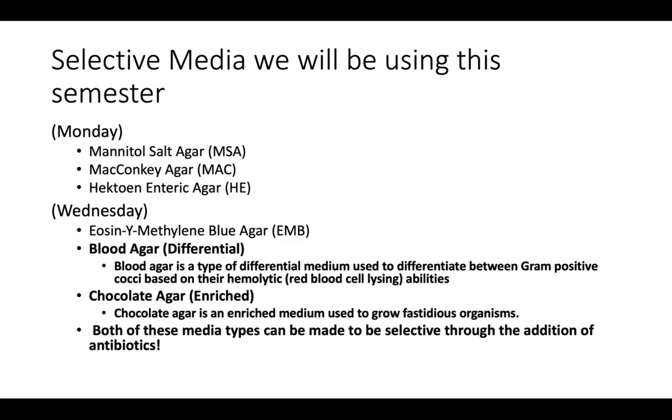So selective media we'll be using, again, on Monday we used mannitol salt agar, MacConkey, and Hektoen. On Wednesday, so this next class, what this Panopto is for, you're going to be using EMB agar, which stands for eosin Y and methylene blue. And you're going to be using blood agar, which is differential only. So EMB is selective and differential. Blood agar is only differential.